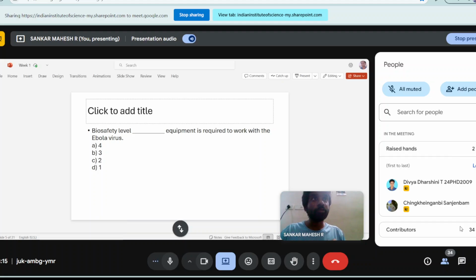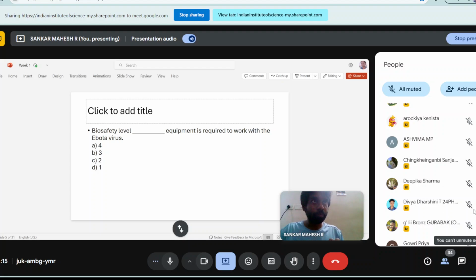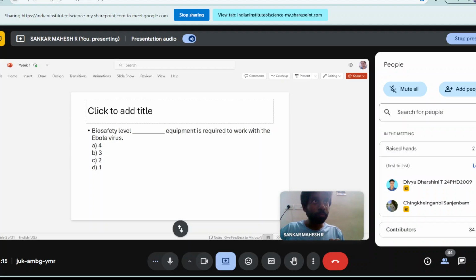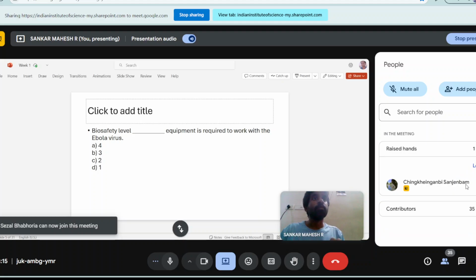You can tell us for what kind of organisms BSL level 3 is needed. Maybe it's used for respiratory microorganism work in cabinet 3, like Salmonella typhi, airborne disease. We can use it for airborne disease, Salmonella typhi, that kind of microorganisms.